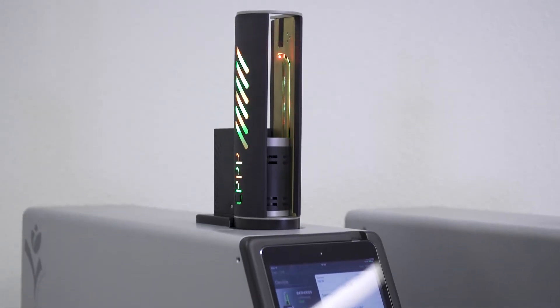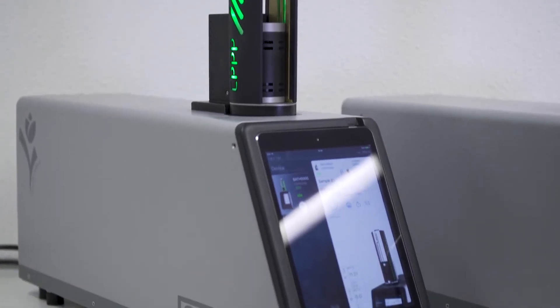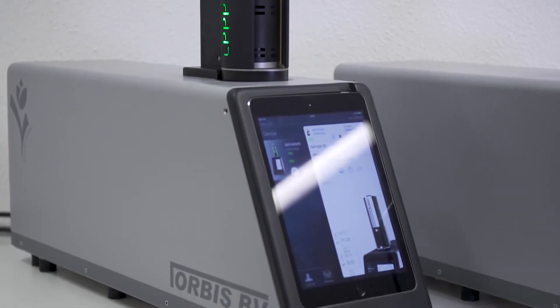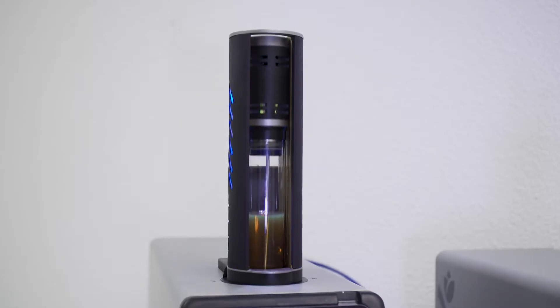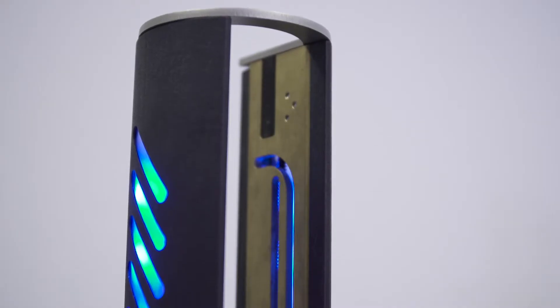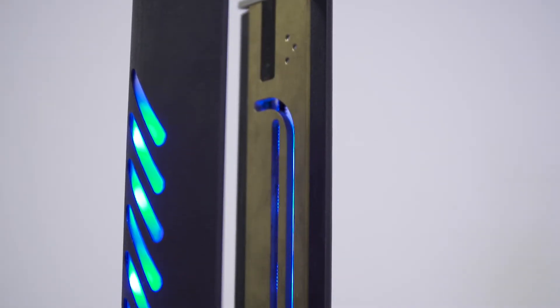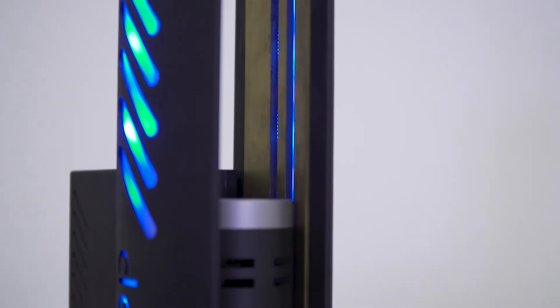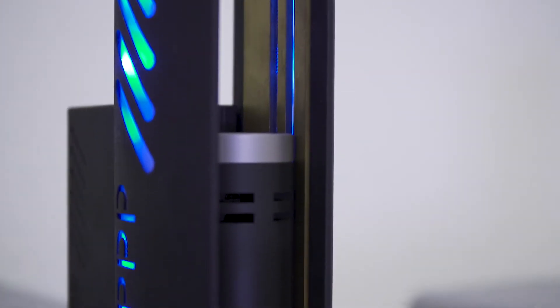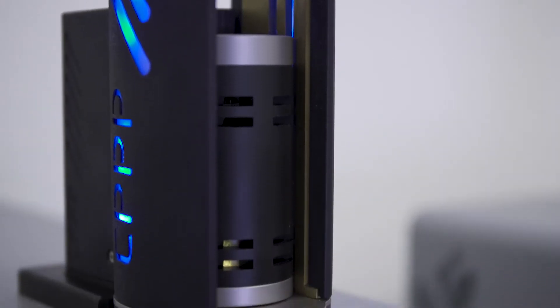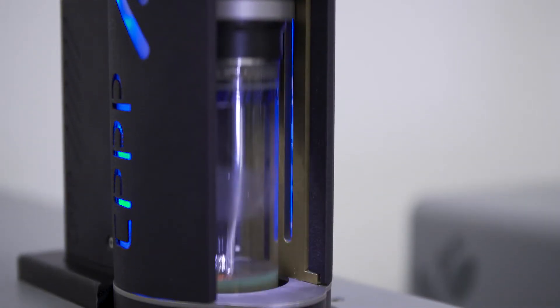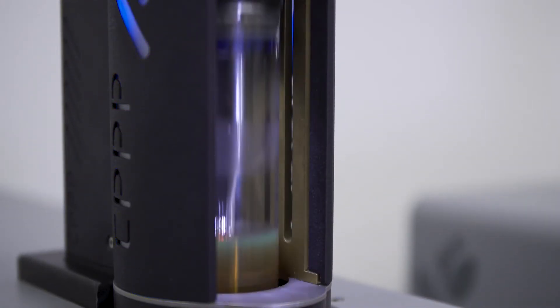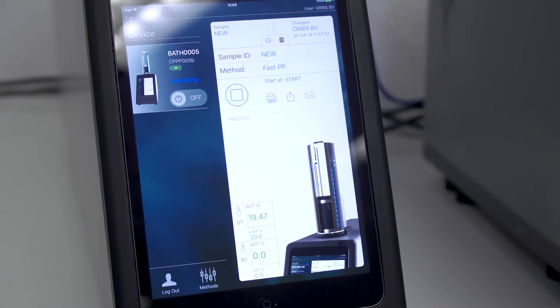Based on the same Airstar platform we have our cloud and pour point analyzer. This instrument mimics the old-fashioned manual test by actually lifting the jar out of the bath and checking the sample with a camera. For the cloud point test this enables us to see the entire sample and cloud forming throughout, not only on the bottom.